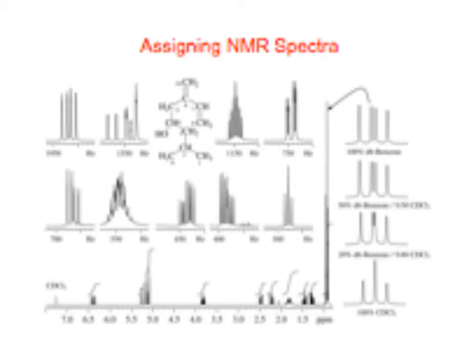An antio-, no. What's the word? Would they be superimposable? Technically no, because if this is CD3, this is CH3, and there's an H, this has become a chiral center.